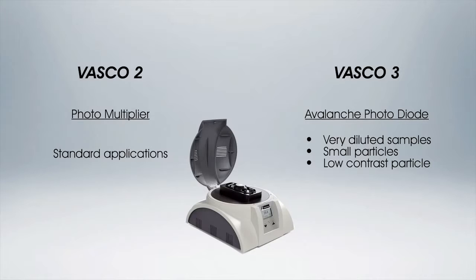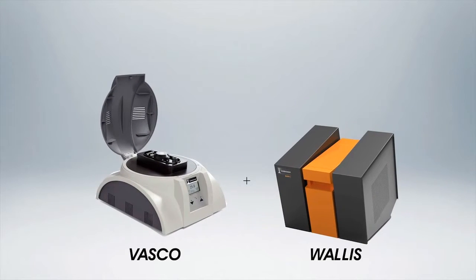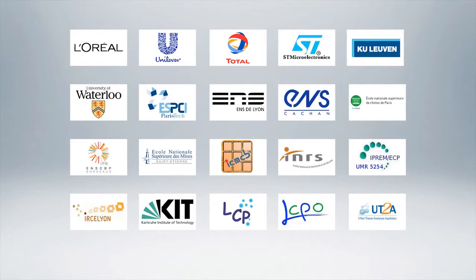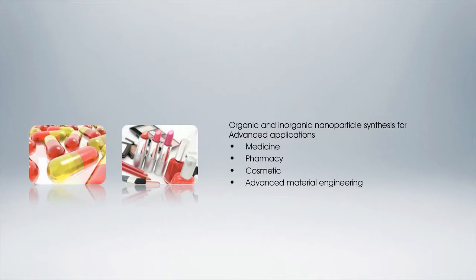Combined with zeta-potential meter, Vasco is an indispensable analysis tool in nanomaterial and colloidal science for research and industrial applications. Today, many customers, industrial and researchers have already selected our products for their applications such as organic and inorganic nanoparticle synthesis for advanced applications.